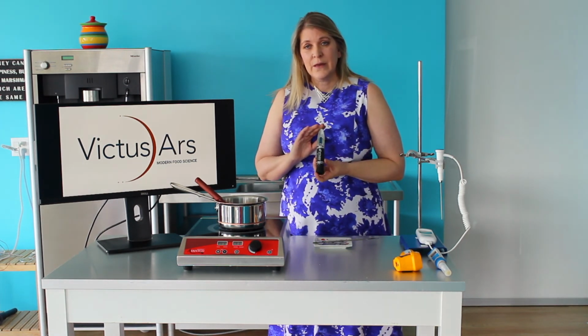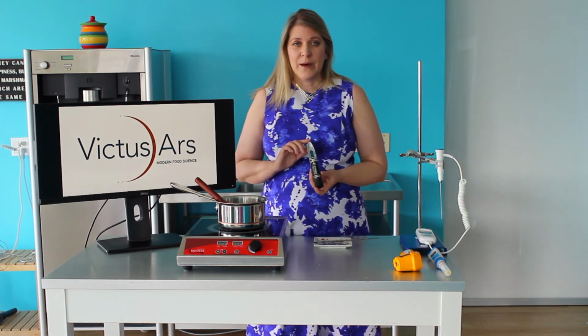Clean your refractometer using warm water and dry it with Kim wipes.